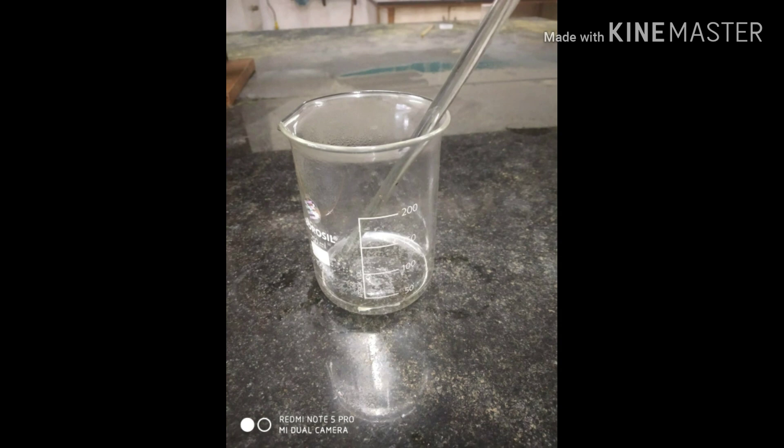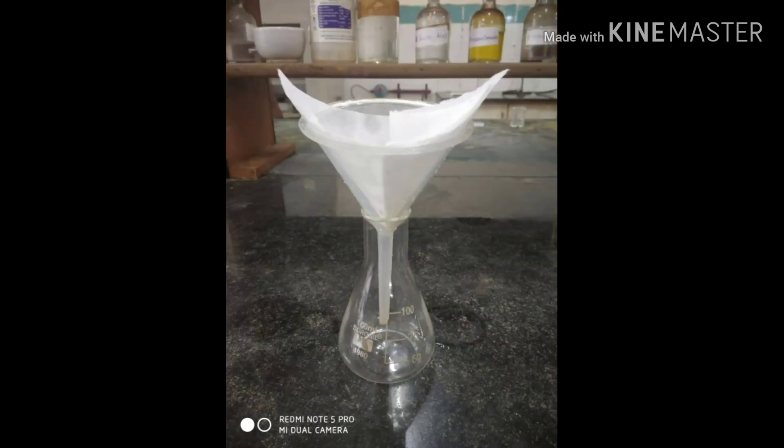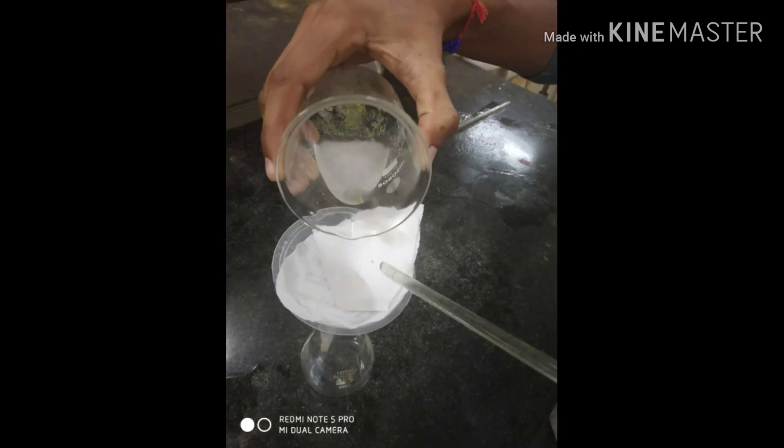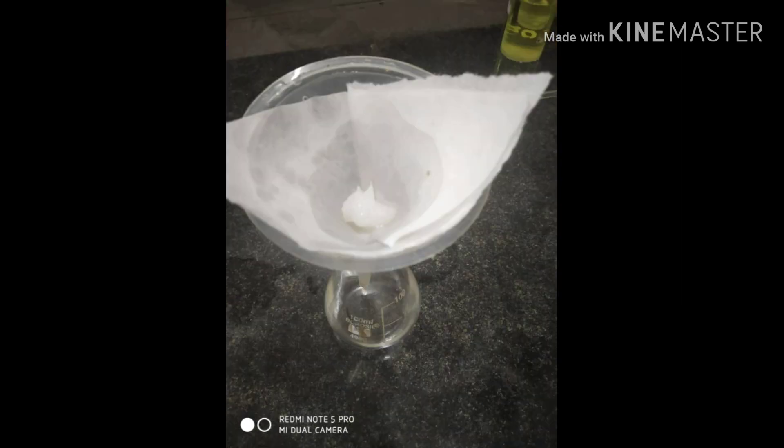The mixture is cooled to laboratory temperature, then transferred into a beaker containing crushed ice. A precipitate is formed. Filter the precipitate and wash it with cold water. The compound obtained is dried and weighed to get the yield.